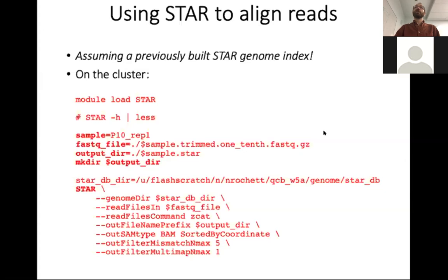And changing this variable here is going to tell the Linux shell that whenever you type star, you might be looking for something that's in this folder, and so it's going to find it because it is star. If I type star, now it's finding that file that we just showed.